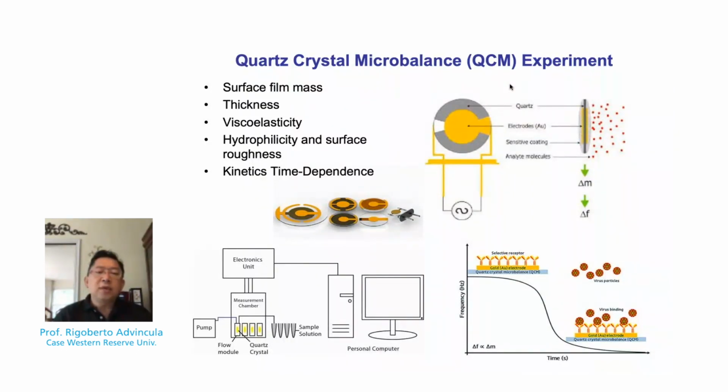So what we intend to do is, for example, introduce QCM enough to gain an appreciation of the technique and the underlying principles behind it, and utilize AFM, atomic force microscopy, as a complementary instrument, or look at some of the developed QCM and AFM simultaneous or in situ measurements that have been reported.